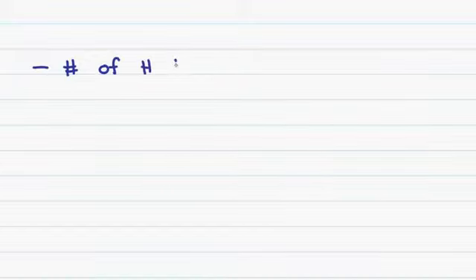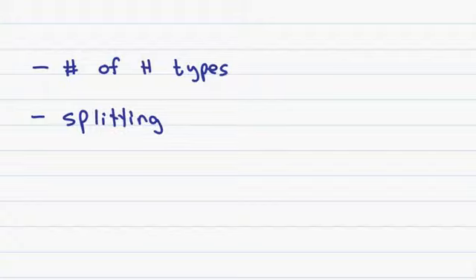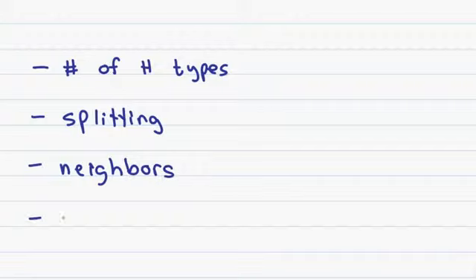However if you understand what I show you, you'll be able to take this information and apply it to more complex examples. The first thing you want to look at is the number of hydrogen types. Then you want to look at the splitting of the peak, you want to identify the number and types of neighbors, and lastly you want to identify the cause of the shift.